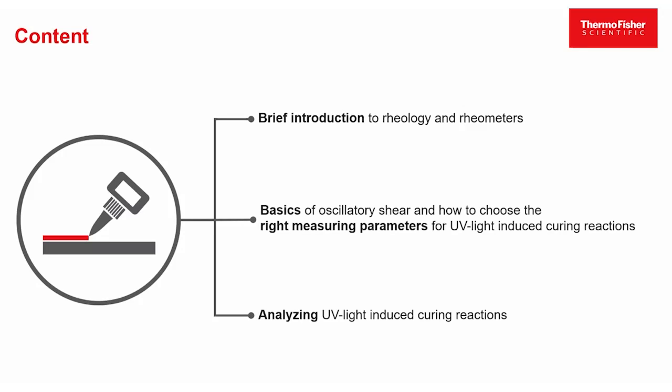Now I would like to come to the main topic of my talk, the rheology of UV curing adhesives. This presentation is divided into 3 different parts. First of all, I'd like to introduce you to the topic rheology in general, as well as rheometers in particular. Rheometers are powerful measuring devices and can be operated in various ways.